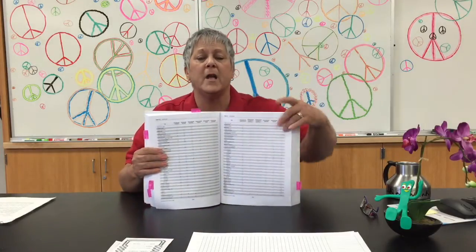Then what I'm going to do is flip through the section and I'm looking for the tables. And you've got a copy of one of these pages. This is the meat and potato of the information that you're going to require for writing your flowchart. So anyways, you will see the organisms' names listed along the top, and let me find that page that has Klebsiella on it.